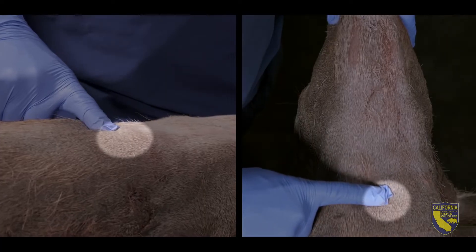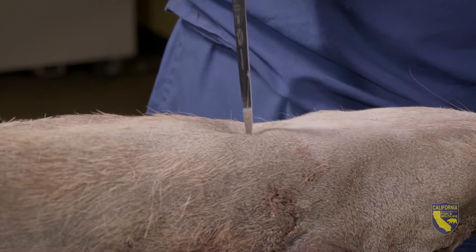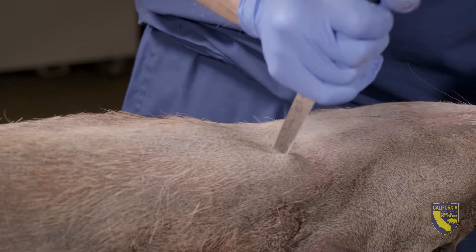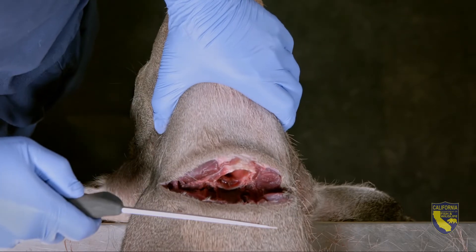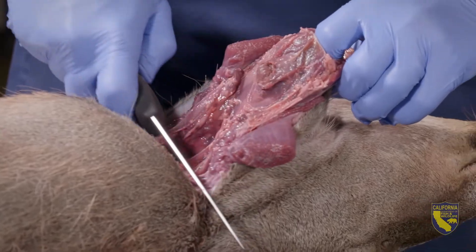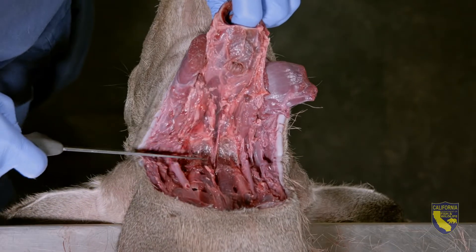This is where you'll cut. Holding the head and neck straight, use a sharp knife and make a stab incision. Start off cutting straight down through the trachea. Once you've cut through the trachea, insert your index finger into the windpipe and pull up and back towards the nose. Continue cutting, angling back towards the base of the ears.